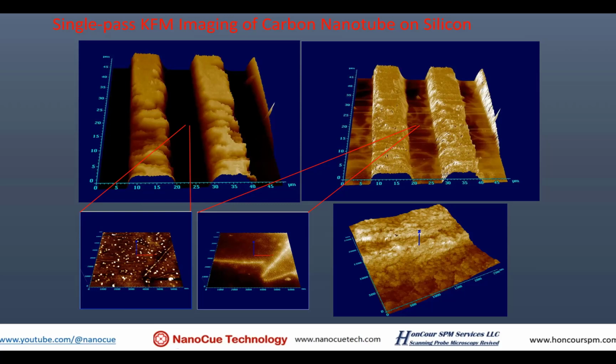Yes. If you use a metal like gold, and the entire thing is conductive, in physics we learn it just equalizes the potential. The potential is completely equal. So yes, you have a very nice image of a piece of white sheet like this, nothing on it, no contrast, because the conductivity of the metal basically equalizes all the potential around.